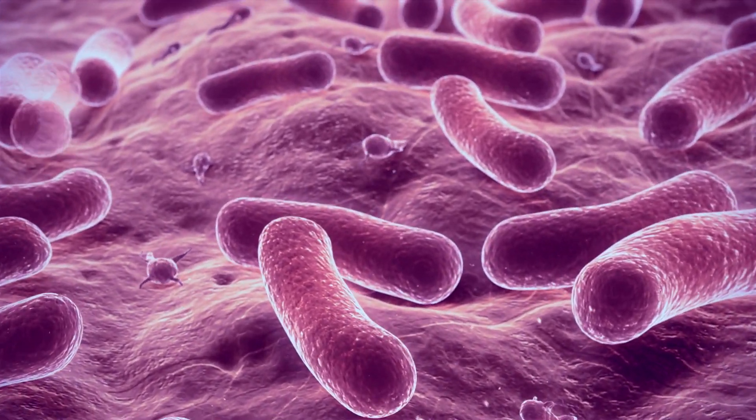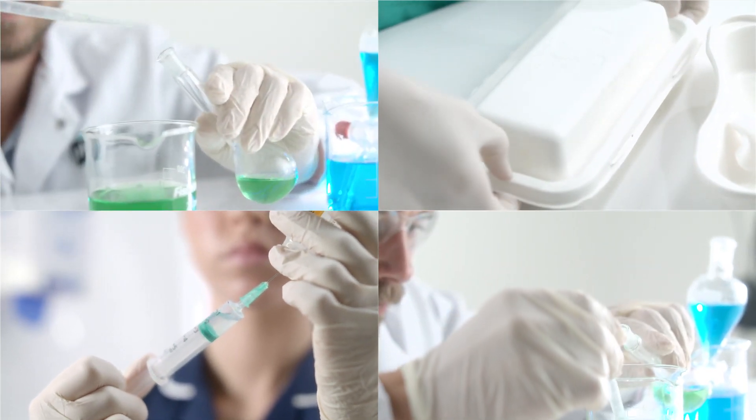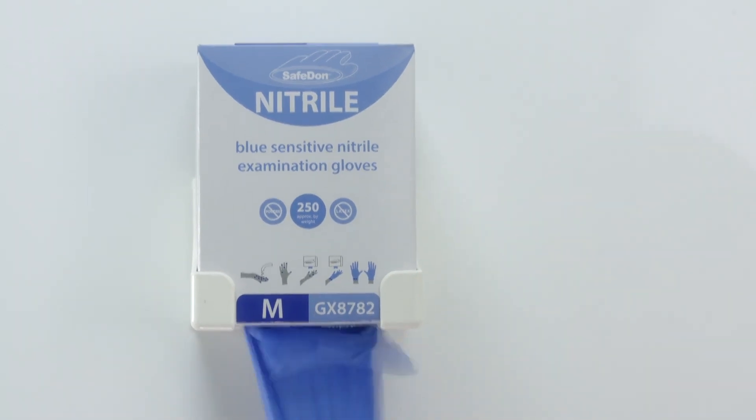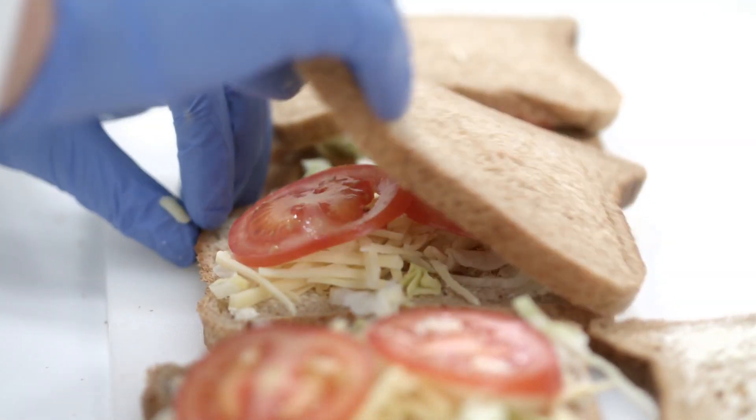Bacteria cover every surface we touch, exposing us to potential infection. Safedon's patented revolutionary dispensing system helps stop the spread of microbes and cross-contamination so you can safely get on with your task.